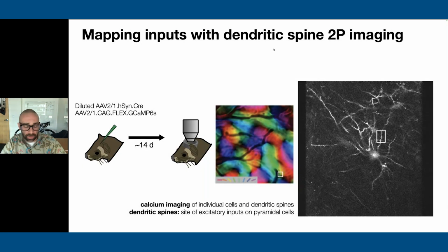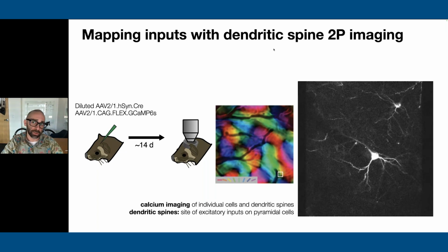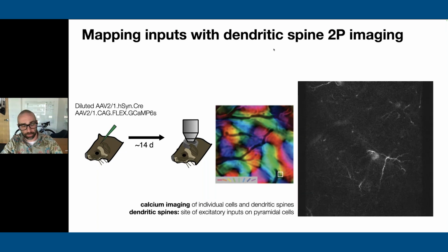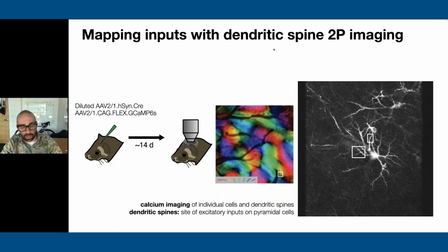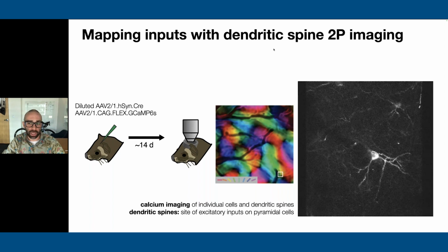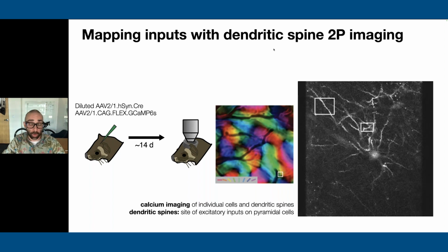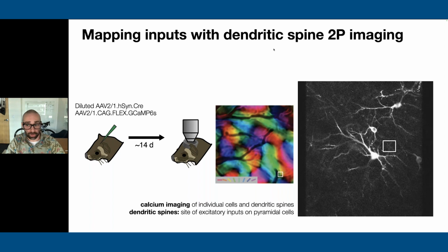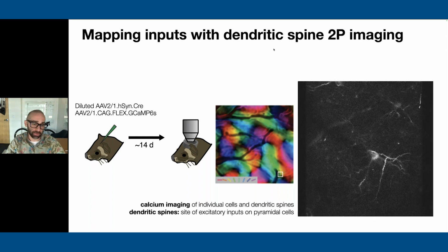historically, I've studied this using synaptic calcium imaging, which is really just conventional two-photon imaging with a little bit of a viral trick, where we sparsify the indicator of interest, in this case, GCaMP, and thus we only have very, very sparse expression of individual cells, and so we can resolve things down close to the point spread function, and that being little processes on the dendrites, such as spines.